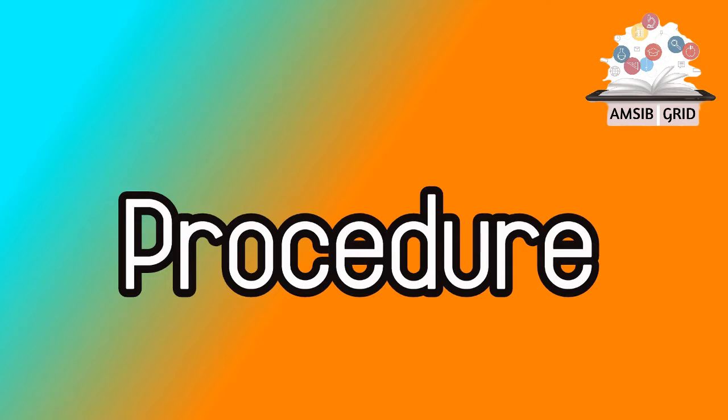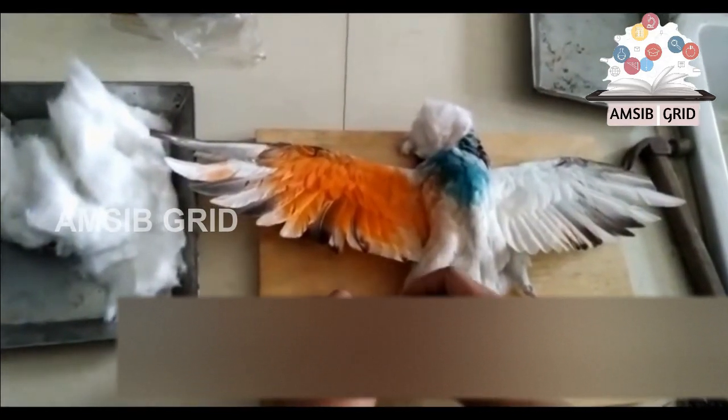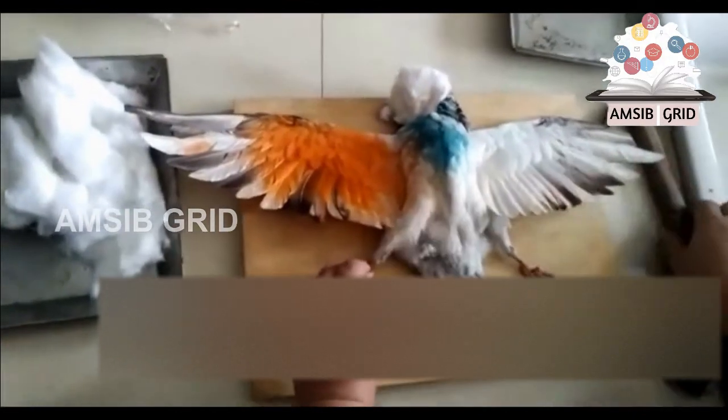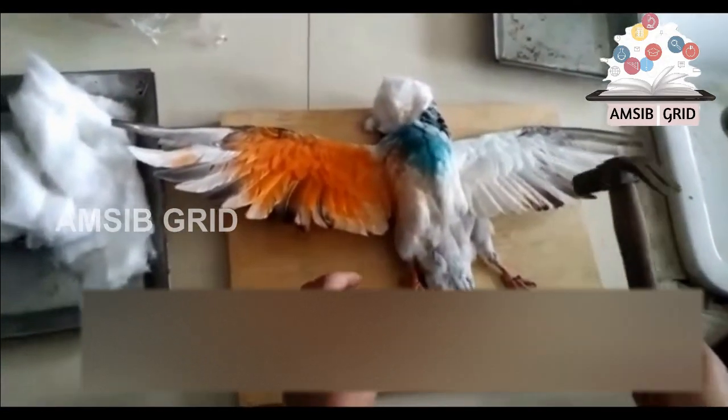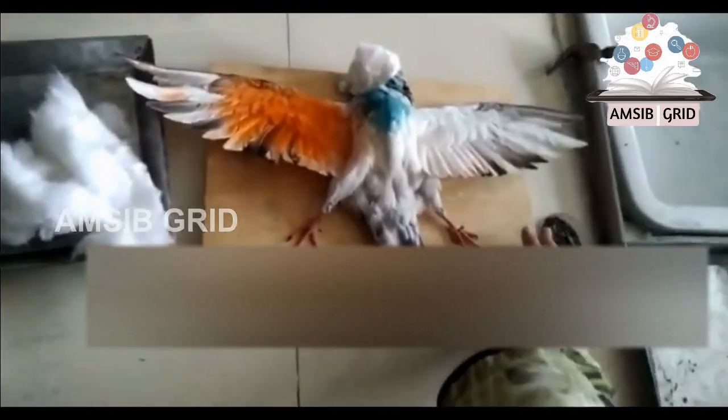Procedure. Give chloroform to the pigeon for anesthesia, or obtain a preserved bird and rinse it with tap water. Place the bird ventral side up in the dissection pan. Pin the wings so that they are spread out, and pin anywhere else that is needed. Remove the feathers with the help of water.